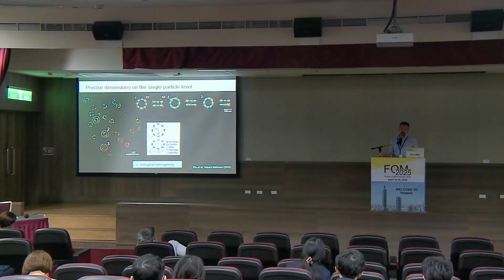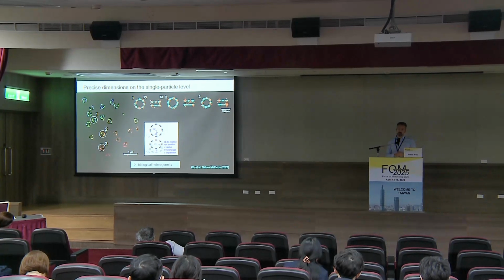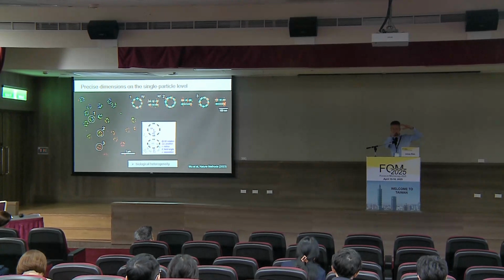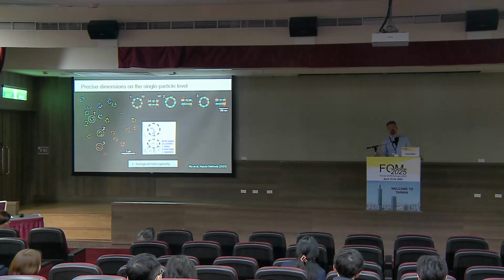If we are not interested in that, then even a Gaussian model performs very well, often even better than an experimental model. The reason is that an experimental point spread function sometimes is a bit not straight, but a bit tilted, and then we get a correlation between Z and X. So if the fitter wrongly puts the Z position here instead of here, it automatically makes an error in X and Y. There, a symmetric point spread function like a Gaussian often results in higher precision and higher quality data. And this is basically the only parameter.